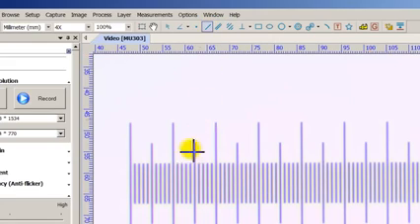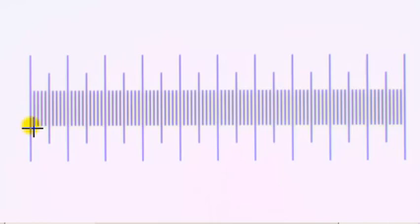So I chose the line, and I'm going to measure it from this point to the middle, and the measurement that should come up is 0.5. And as you can see, it's pretty accurate. I mean, I could have done it a little bit better, but right now it says it's a little bit off.